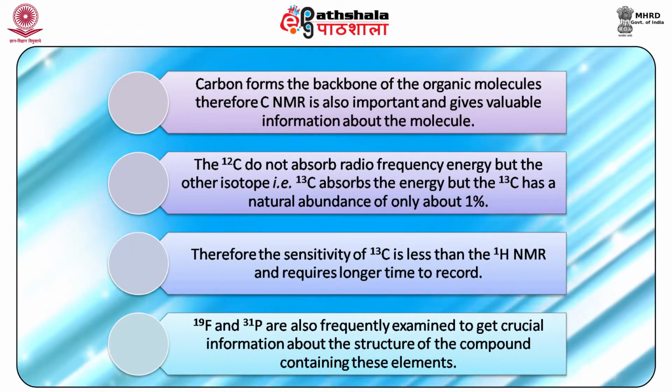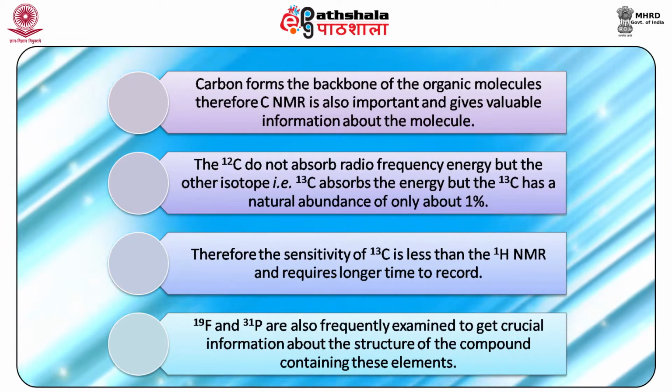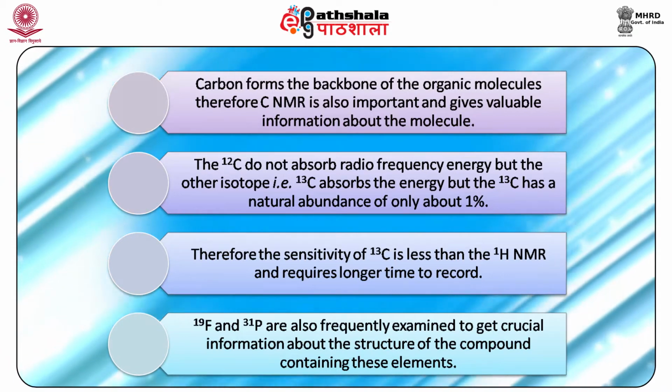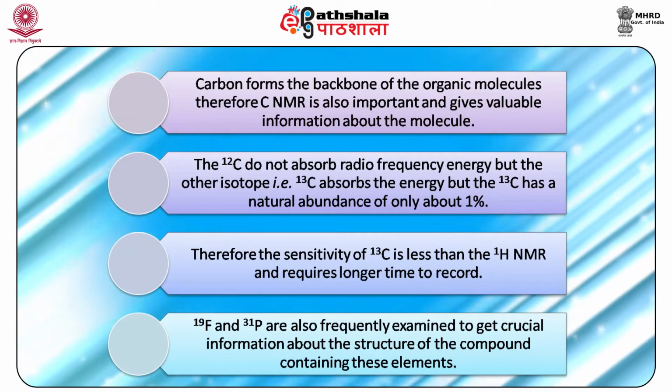19F, that is the 19 fluorine, and 31 phosphorus are also frequently examined to get crucial information about the structure of an unknown compound containing these elements.